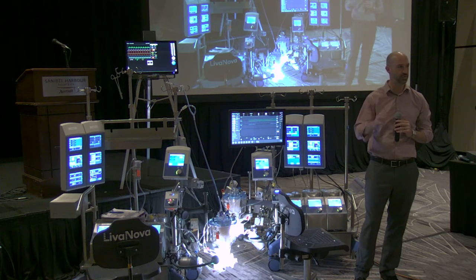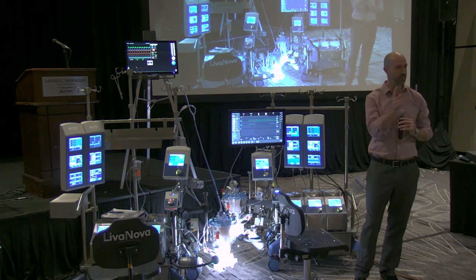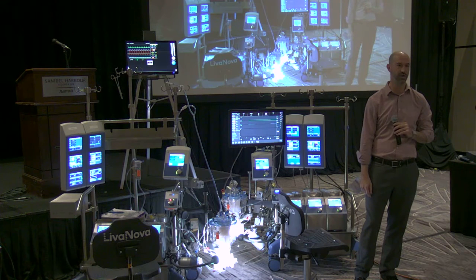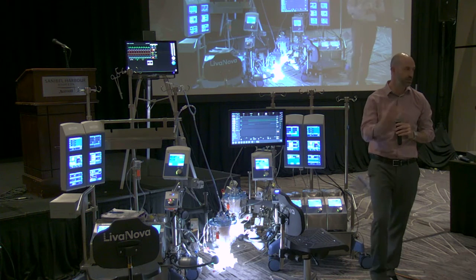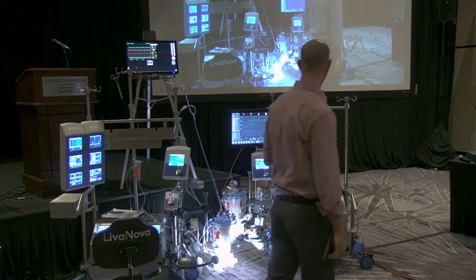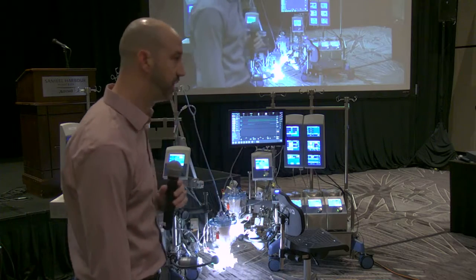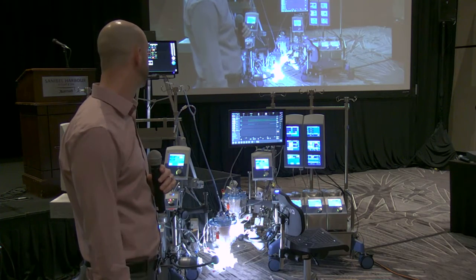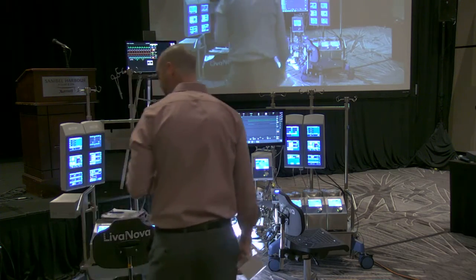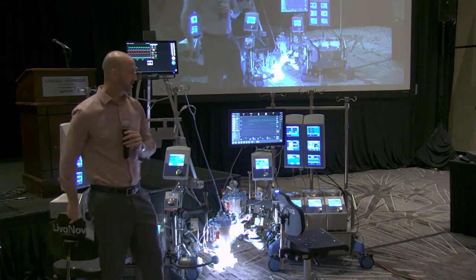I think that's a really powerful feature, especially for the Connect users out there, where you just get a single box with the data, but it's not manipulatable, right? You just kind of get in there and you get what you get. Everything is highly customizable. You can move through the different parameters and really capture everything you need to capture. But Nina, thank you. Great job as well for the Califia people. So I think that concludes our charting challenge.